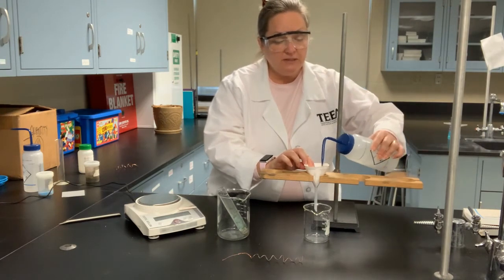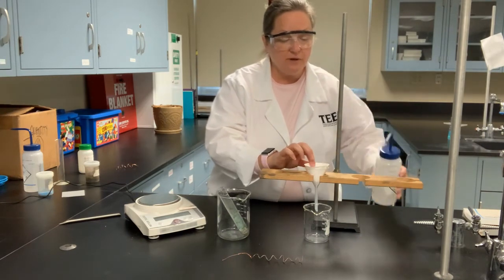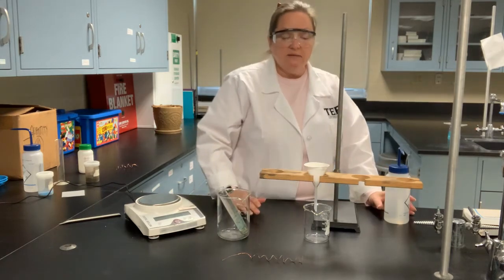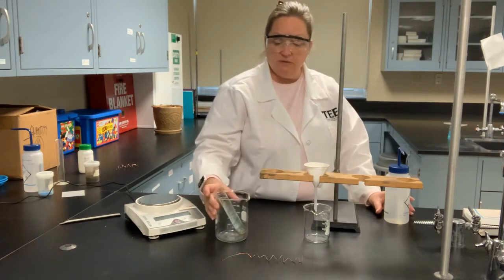Now I'm just going to use my deionized water bottle to add a little bit of water to the filter paper, and this is simply to get the filter paper to stick in the funnel and stay in there and not pop up out as I'm proceeding through the process.